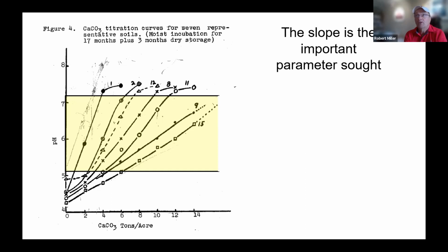So correct me if I'm wrong. If I'm dealing with a water pH of 5.4, where I see the aluminum start to be an issue, then the one normal KCl pH is going to be probably about 4.2, 4.3, 4.4. Yeah, it's about 1 pH unit difference at the lower pH. As you increase pH, it's 0.9.